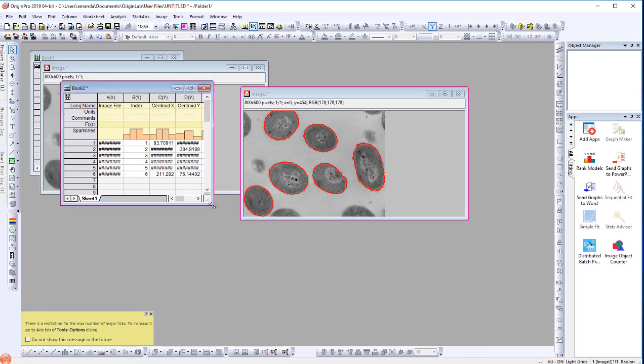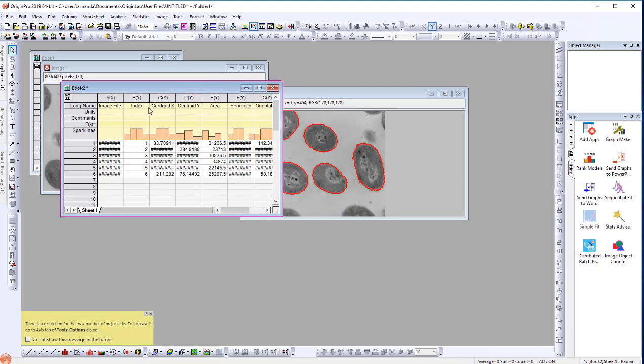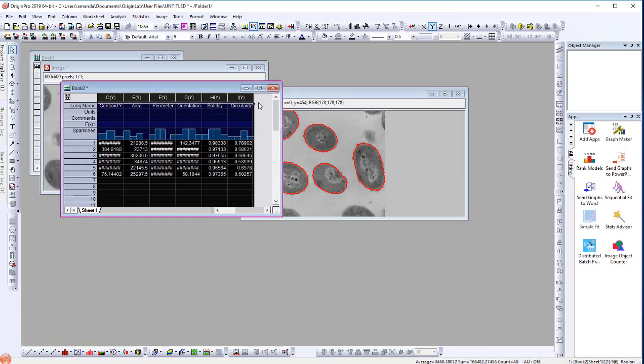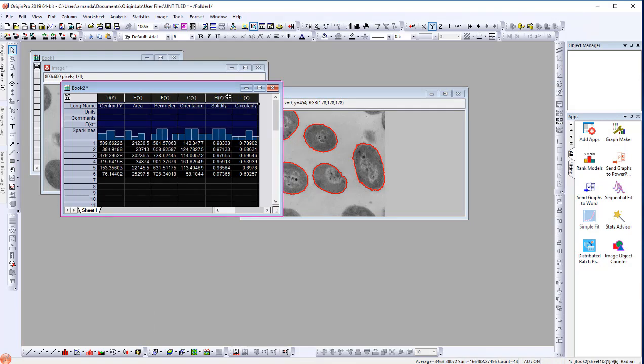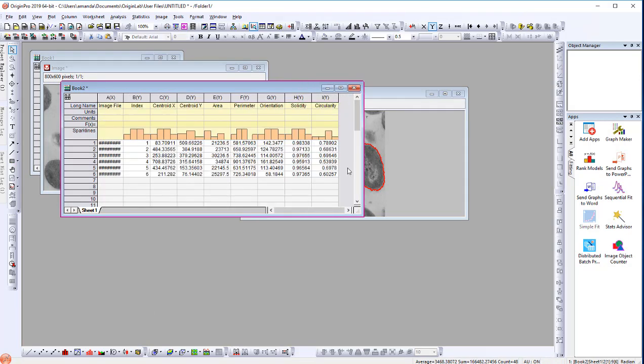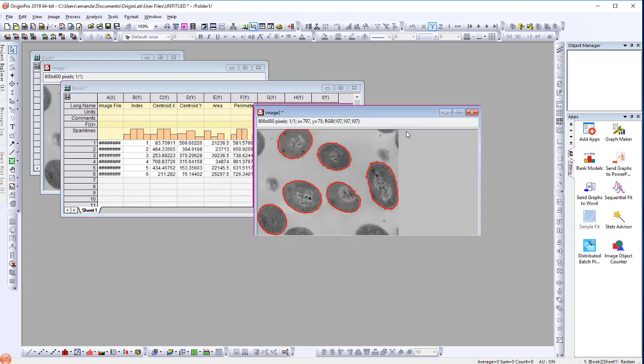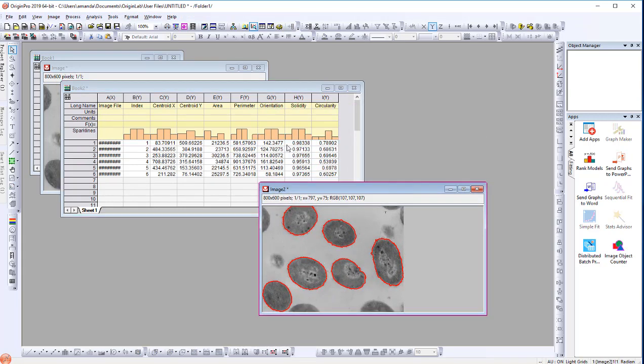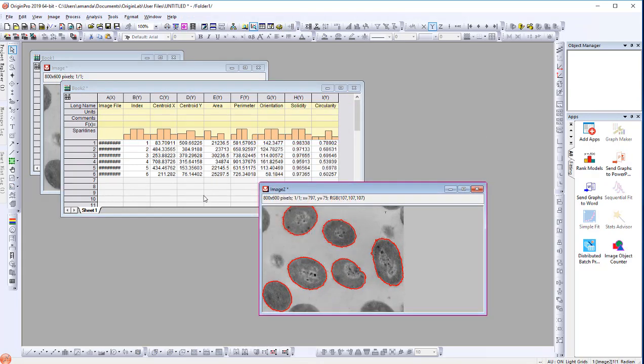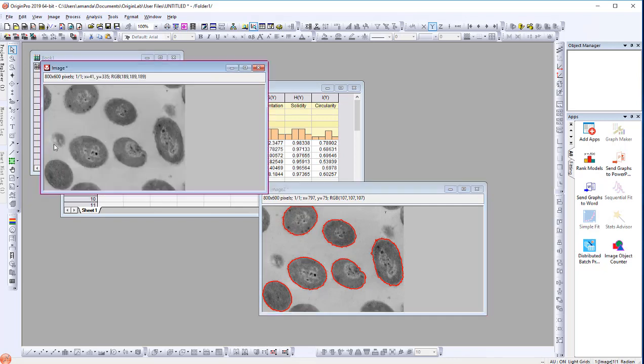For example, the Centroid X and Centroid Y, the Area, and other properties. You can as well view the image with the added red object markers.